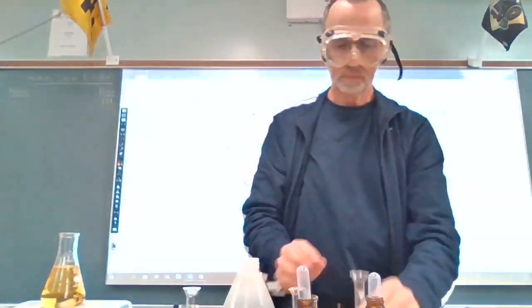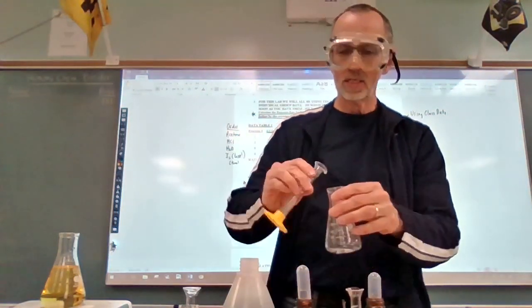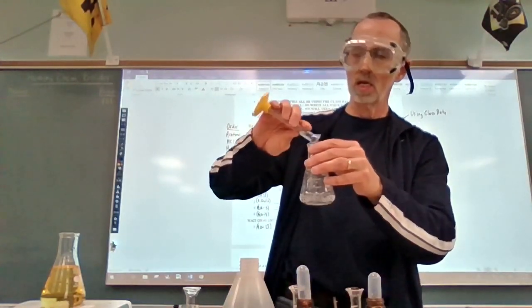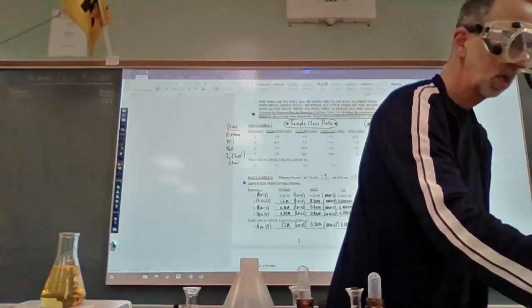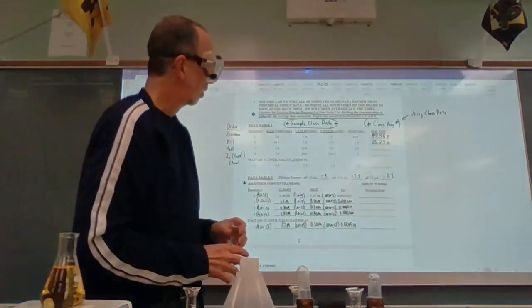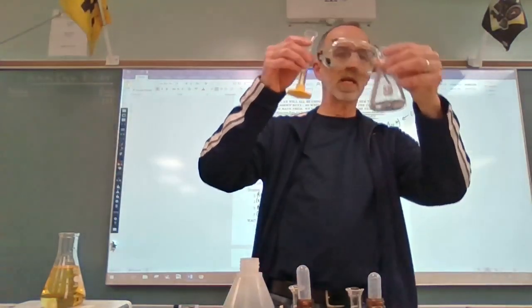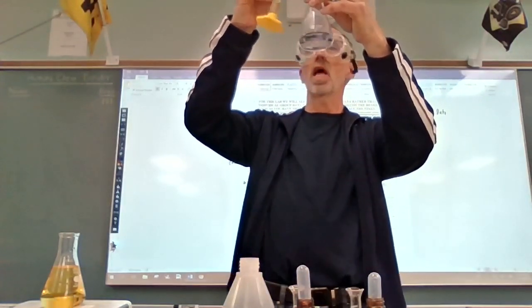So again, I'll add the first 3 to our flask. Add it back on. Clear. All right. We're now going to get ready to run reaction 3. Again, I'm going to be a little delayed on my timer beginning because I'm missing that third hand.